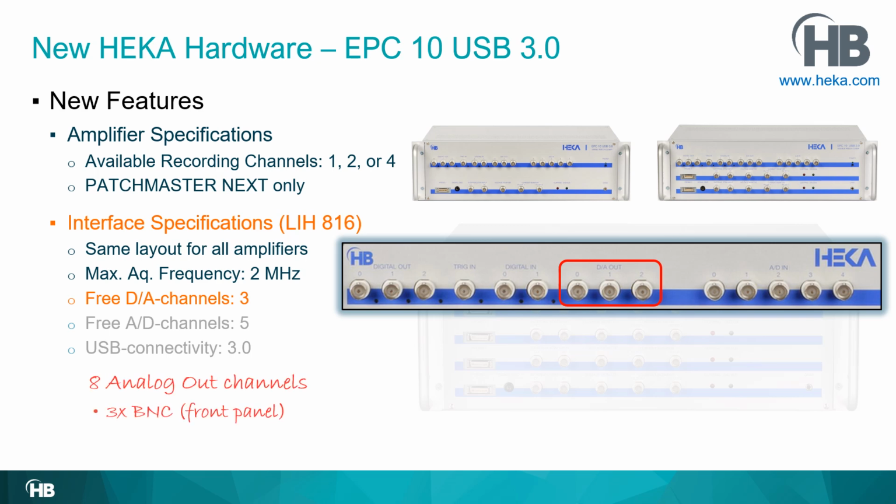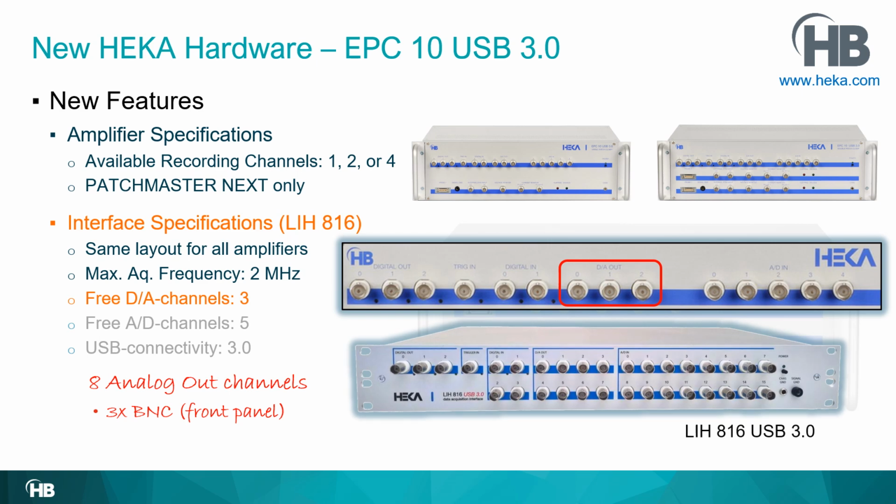However, the interface board itself has 8 analog out channels, and 3 of those are available on the built-in version of the interface. When you look at the standalone interface, you see that all 8 analog out channels are available right here.